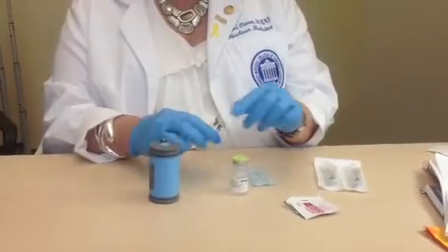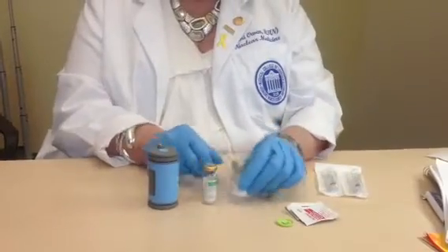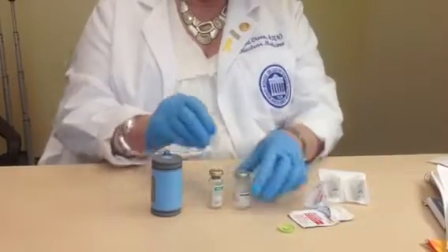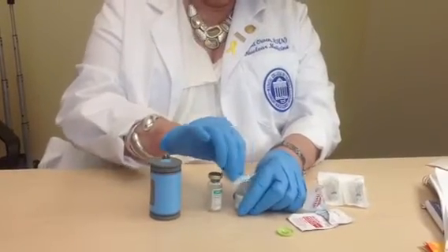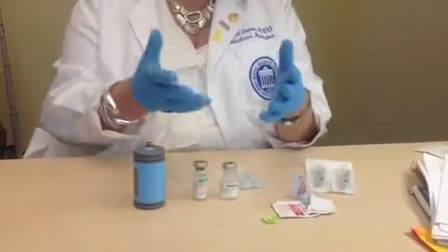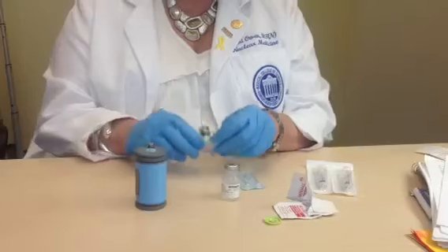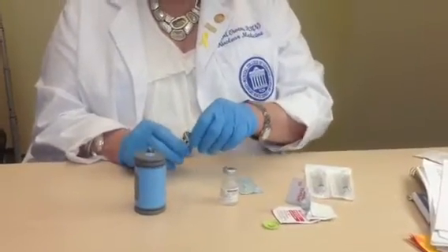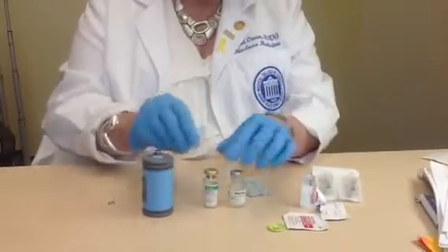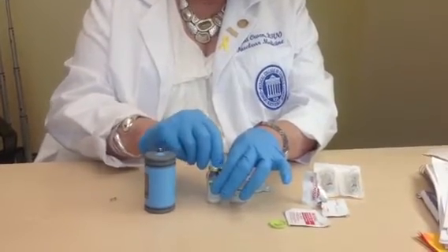So in order to do this, first of all, we're going to make sure that each of these vials are treated aseptically. We're going to clean the tops of the vials with an alcohol wipe, because that's where we're going to be introducing the needle, and of course we have gloves on to do this. We're going to do this for the DMSA vial. It's a little more complicated. There's a little circular port cover in the middle. Again, we're going to wipe that off with the alcohol wipe.